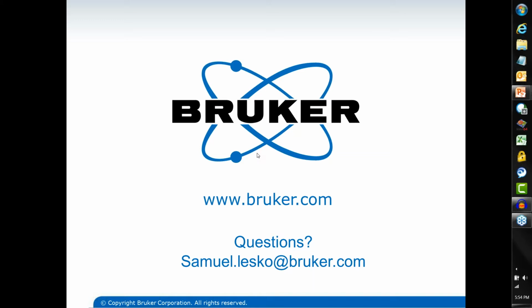All right, so first of all there were questions regarding thin film, and the question is about what kind of additional information we need to know the thin film thickness. We need to know the chemical compositions of the thin film and the substrate. We also need to measure the optical response on a reference surface. By reference surface, I mean a surface where you don't have any thin film. So those are the two elements you need to know.